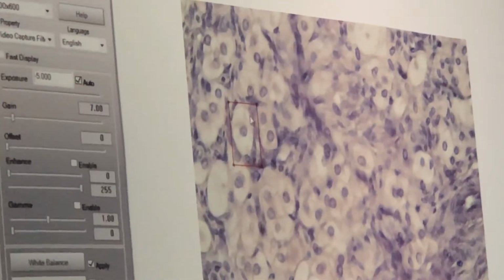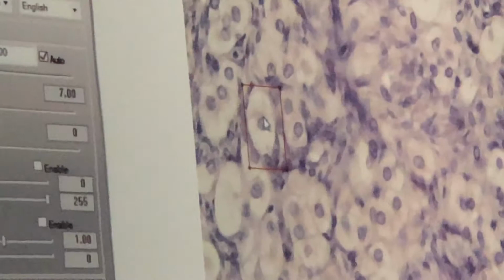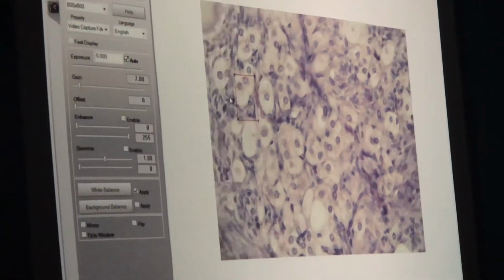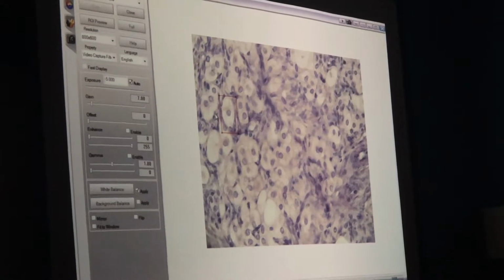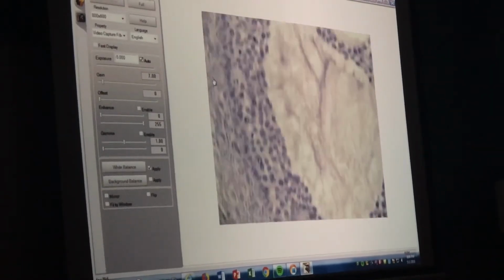See it? So what's this? Right here. That's the ovum. You see these little flat cells around it? Yeah, those are the pregranulosa cells that look kind of like a simple squamous epithelium. All right, so those are my primordial. If I'm going to find a primary follicle, what will be different? Cuboidal. Yeah, so the epithelium around it is going to look more cuboidal. So let's see if I can find one of those.